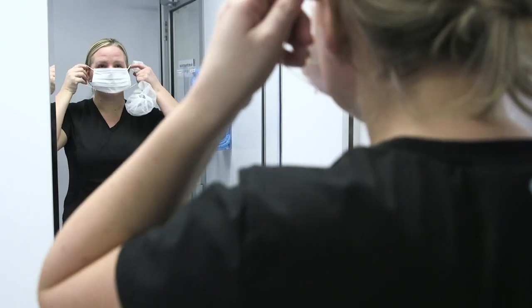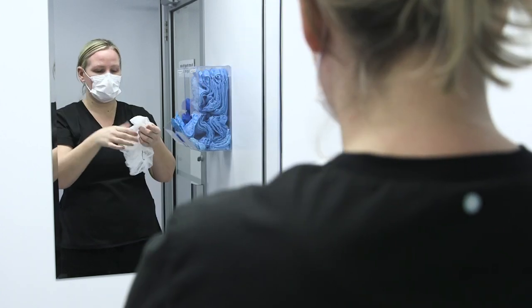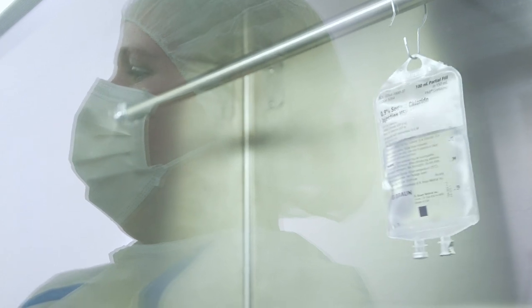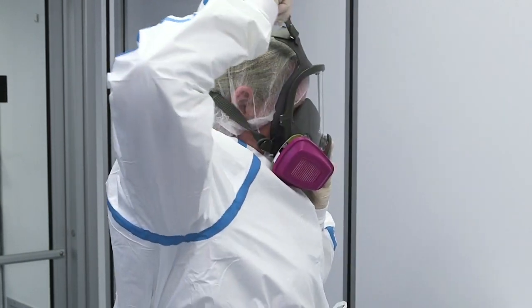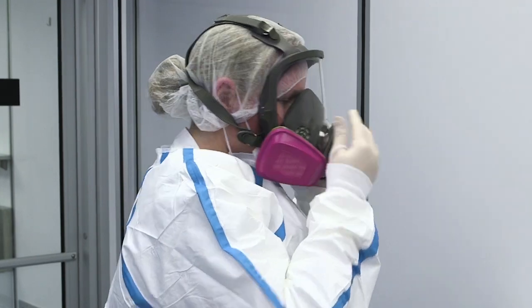For most activities requiring respiratory protection from particulates, a fit-tested, NIOSH-certified N95 or more protective respirator is sufficient. Consider using a fit-tested, NIOSH-approved, full-face, dual-chamber respirator with a multi-gas particulate canister attached if exposure to vapors is likely.